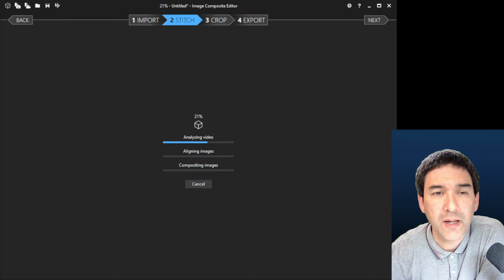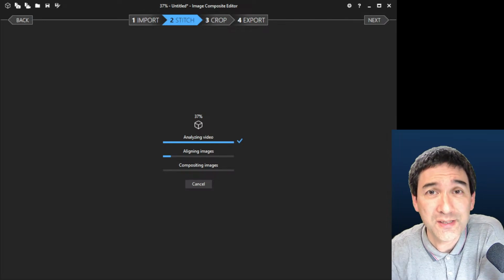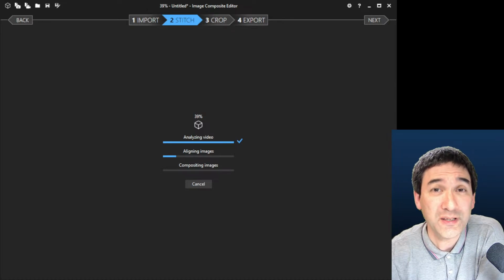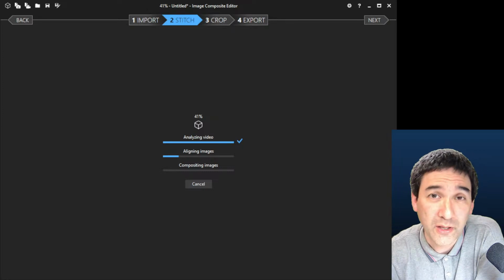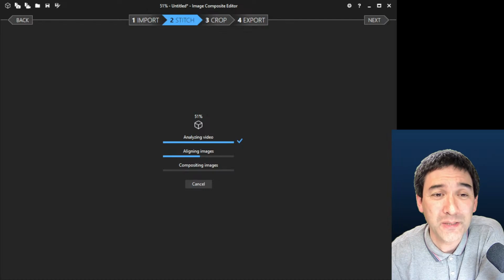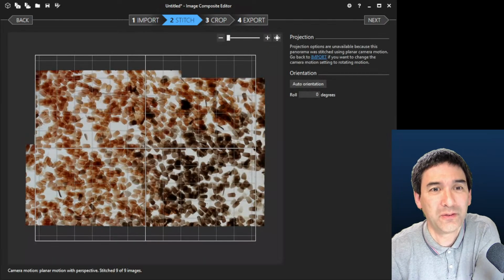So why am I doing this stuff, you might wonder. I do receive emails and comments, and people of course want to get a new microscope, and they want to upgrade, they want to try out new things, and so on. And I recommend that if you want to try out things, of course you can do that, it's not a problem, but it's not necessary to always tweak around on the microscope. Sometimes it's also quite nice to simply do a little bit of image editing and stitching and stacking images together and so on. So it's not always necessary to do hardware.